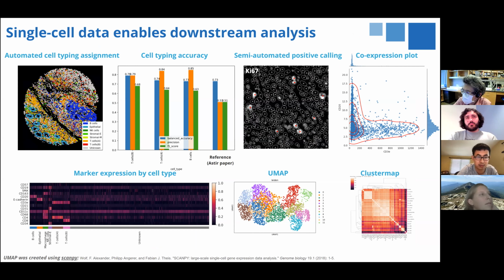There are some other figures I will not go over, but this is what we're doing, and we're also working with pathologists to better formulate what question we're trying to answer with the data to fulfill the research goal. One more thing is that visualization was done using open source packages, and we also use Minerva Author and Story to do interactive data exploration, which is pretty cool and worth another demo in the future if we have time. But with that, I'll stop here. Thank you. Thanks a lot.